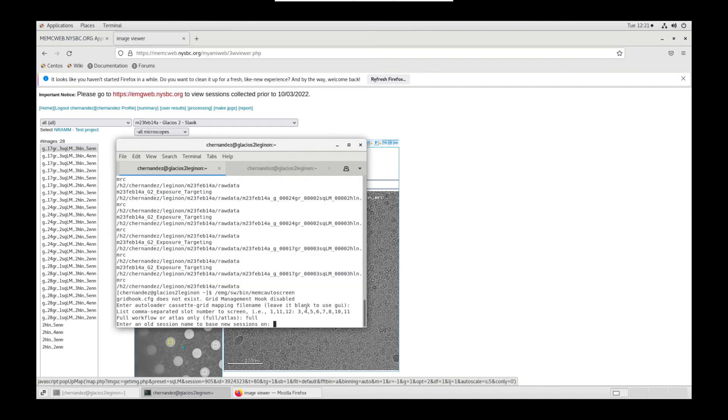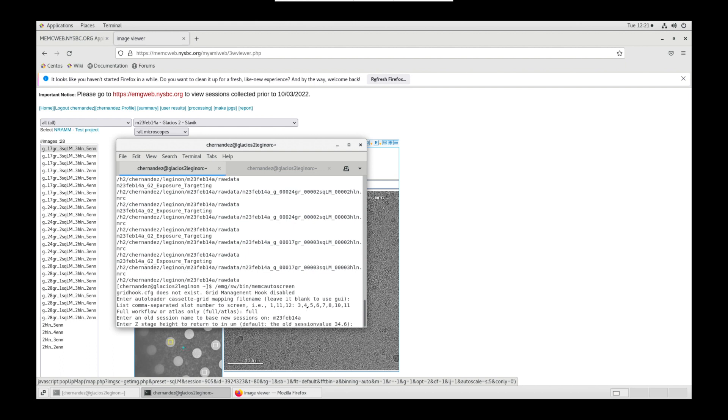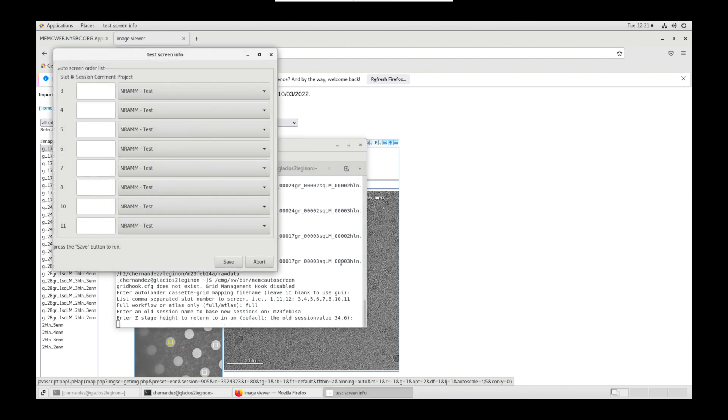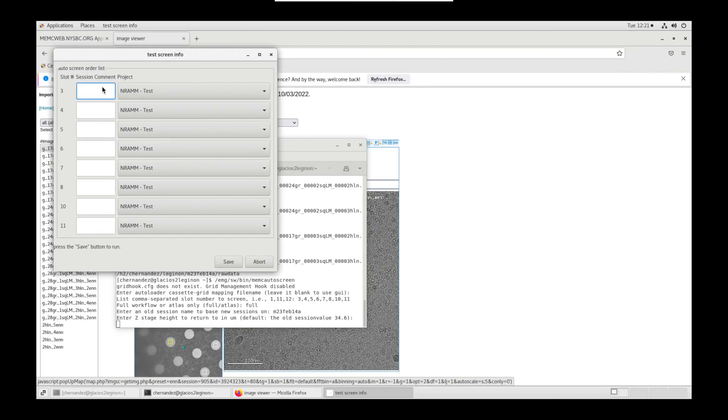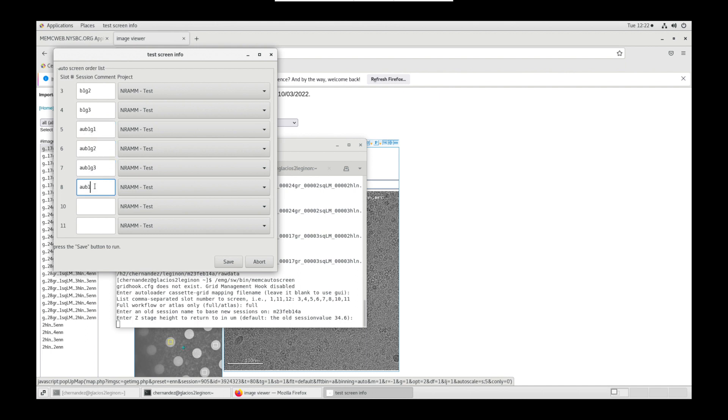In internet browser, open nccat or memc web and go to your session. Enter this session's name and hit enter. Hit enter again to use old session's Z value. Test screen info box will appear. Verify that the projects are correct and label each session name per grid. If you're utilizing different projects for different grids, you can click on the drop down menu and select the correct project for that grid. Click save when done.